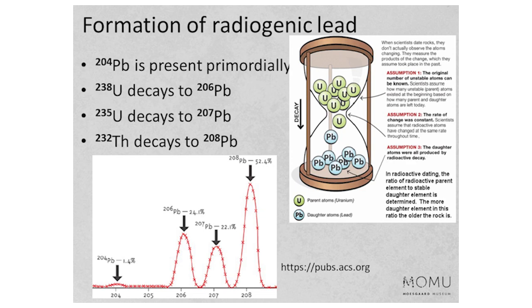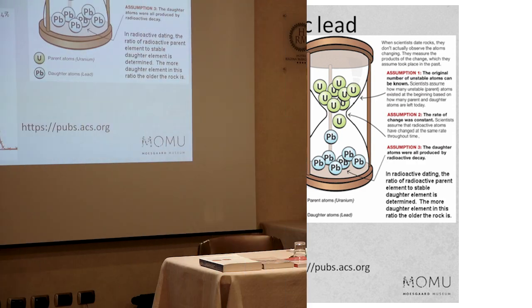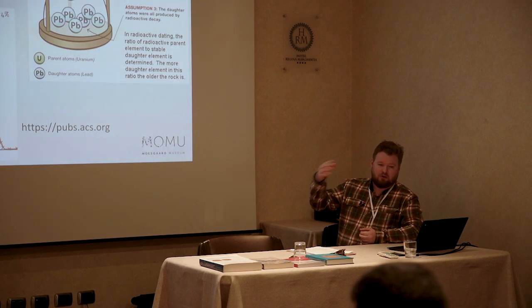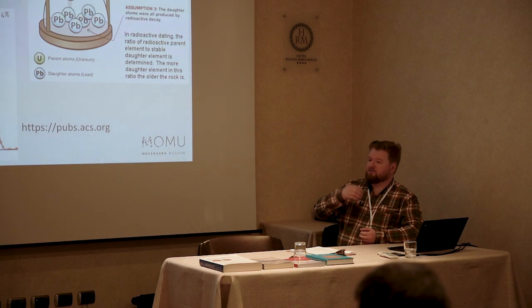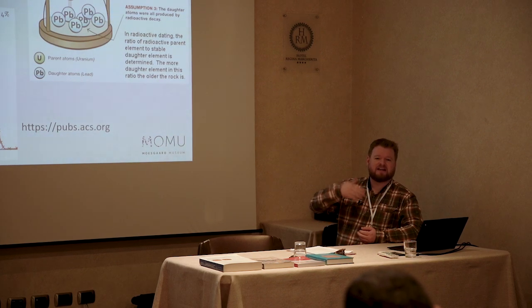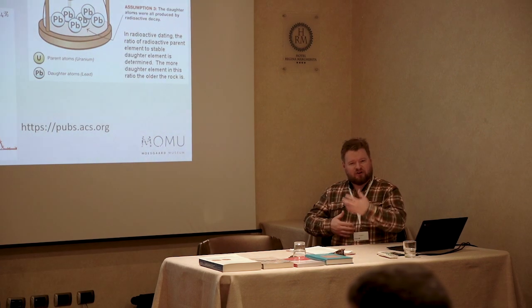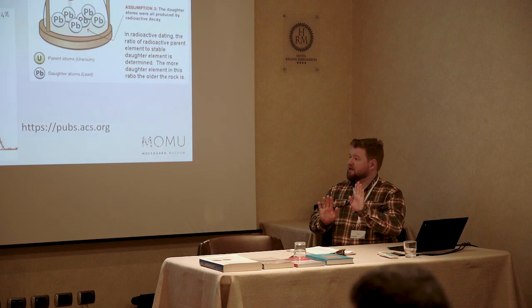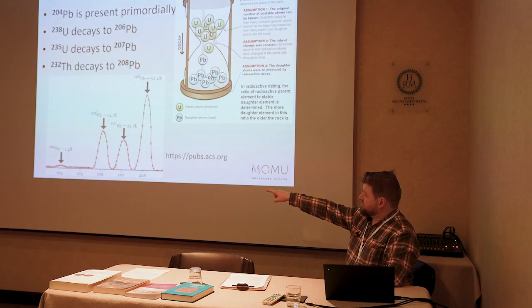Thankfully, lead is in a lot of metals and in a lot of ore deposits, and so what we're looking at is the ratio of different isotopes of lead, and in a nutshell, thorium and uranium are part of the Earth's continental crust, and they decay, and the rate at which they decay gives us varying amounts of these isotopes.